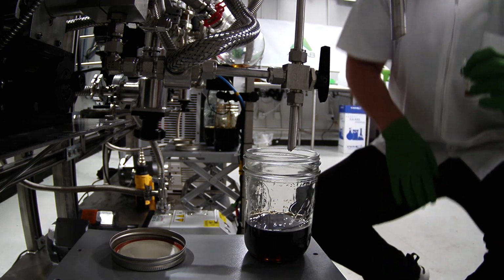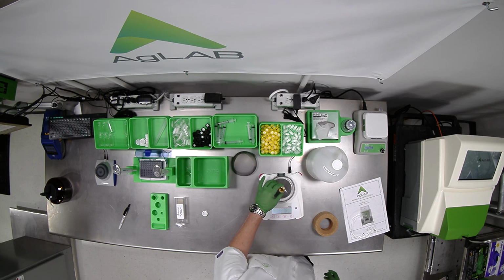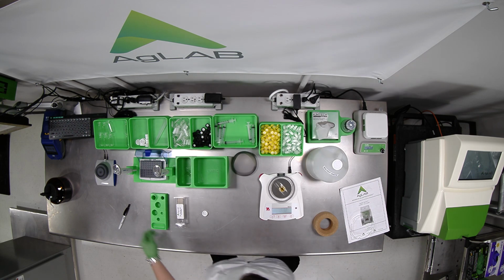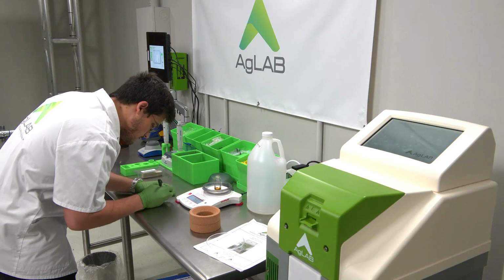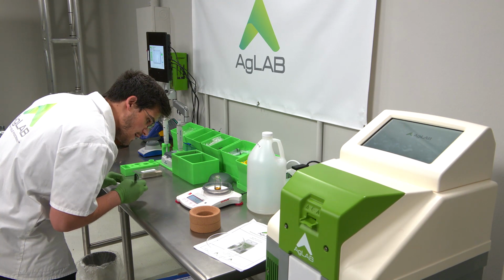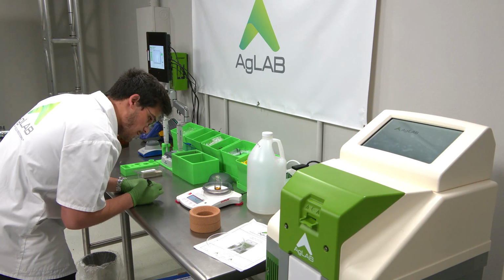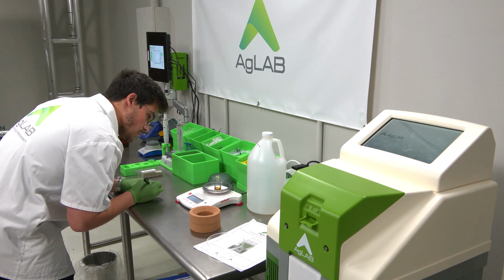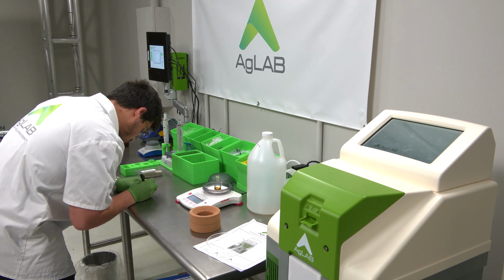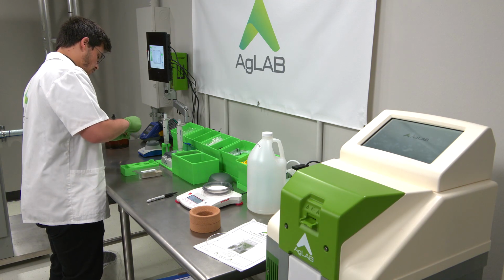Okay. All right, placing it back on the scale, which was used to tare it. All right, and we took 1.532 grams from the distillation system. And this is stage 1 distillate sample number 1. Go ahead and cap this while I get set up.